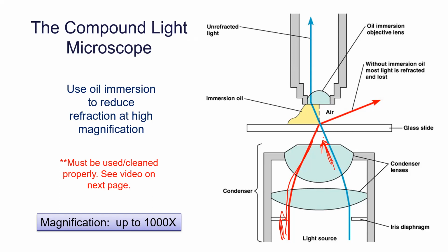So we are going to look at a video talking about oil immersion. I'm not going to do that today. What I'm going to do is actually play that video for you at the beginning of Lab 4, so you have an idea how oil immersion works.